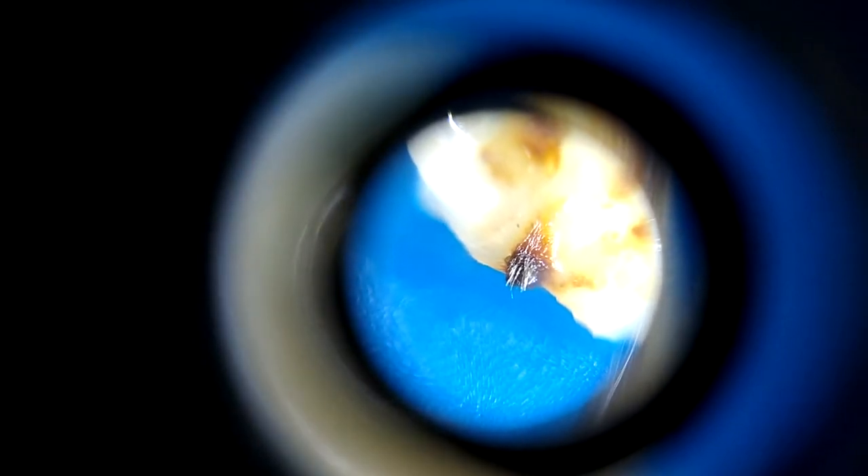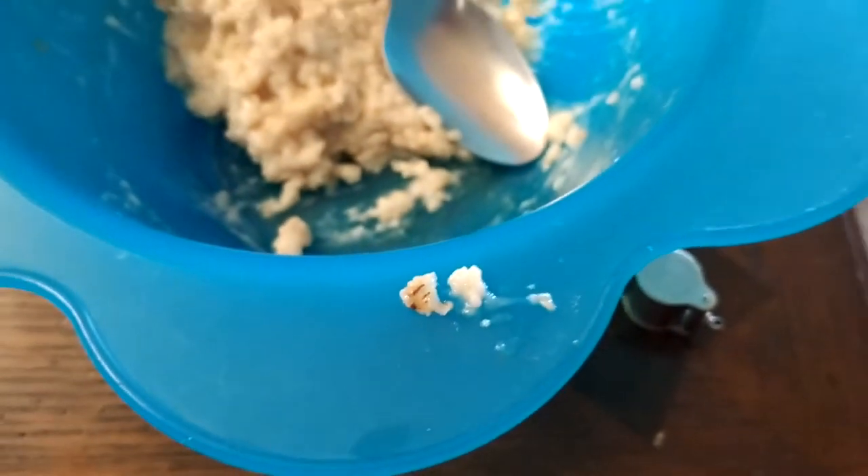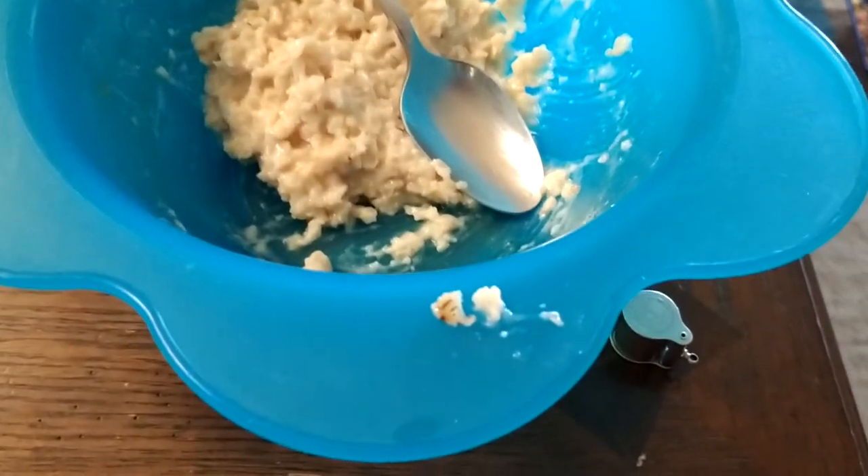See the hairs, or the mandibles — whatever that hair-like stuff coming off the insect is called. That most certainly is a piece of insect — that's part of its legs. And what we're looking at here is just a little piece I found in the oatmeal.